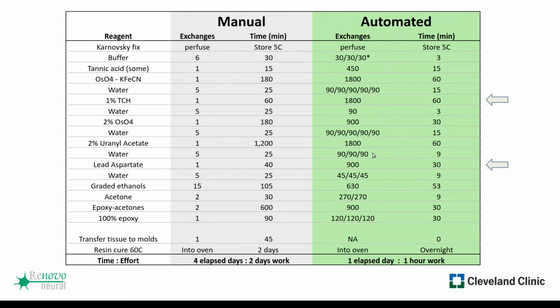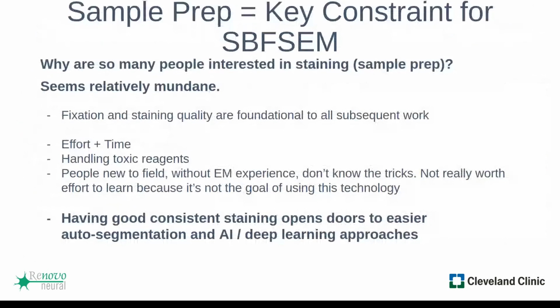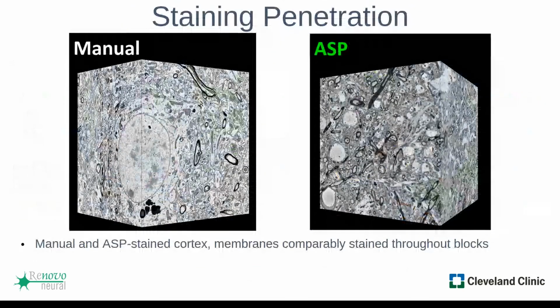Okay, great. There's a very specific question about the G ratio measurement. The question asked, you mentioned N equals 1. Is that 1 axon or 1 block? That's 1 animal, because we did a within-animal experiment. Let me go to the slide too. Oh, sorry, I think I went too far back. I'm so sorry. It was 100 axons in the same animal.